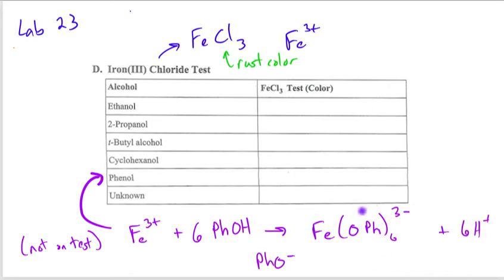But this forms a very dramatic color change, and you'll see it. I'll say purple. It's really more of a black purple. And all you're doing is recording it. If you see that black purple solution, then it's a way to test whether phenol is present.